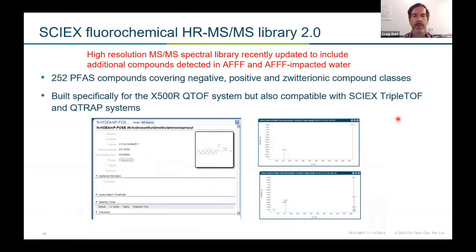Where do those library databases come from? SCIEX has a really comprehensive library for PFAS, over 250 compounds, covering a wide range of PFAS, including a lot that come from AFFF, the firefighting foam mixtures. And so that's what we use as our database.